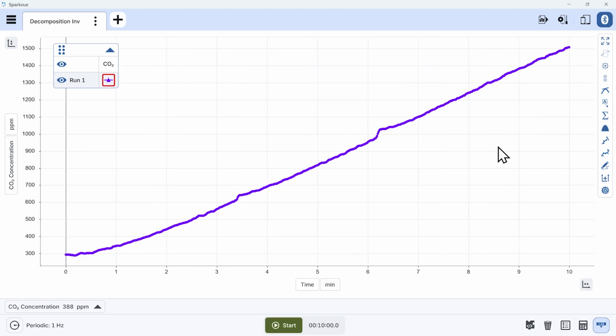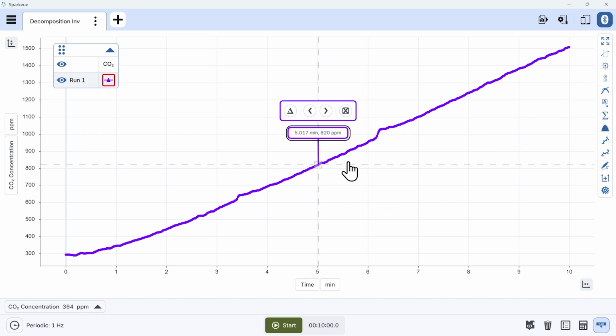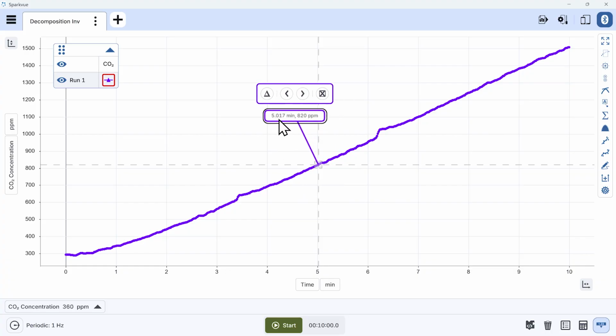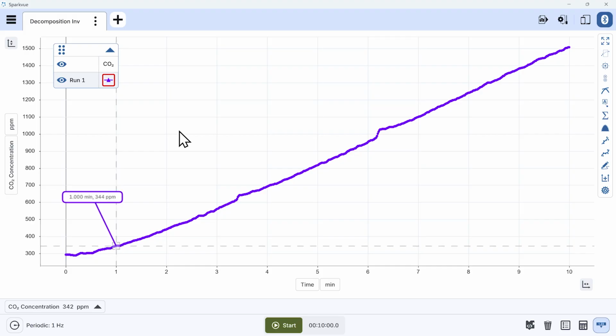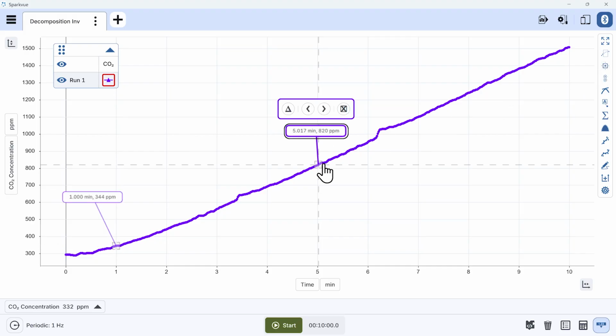While students could read approximate values from the graph axes, the Coordinates tool provides a more accurate method. Press the Coordinates tool button in the graph toolbar to add a Coordinates tool to a data point somewhere in the middle of the graph. The Coordinates tool label shows the x and y coordinates of the data point under the gray box. Drag the gray box to another data point, or use these arrows above the label to nudge it from point to point. Add as many coordinates tools as you'd like.